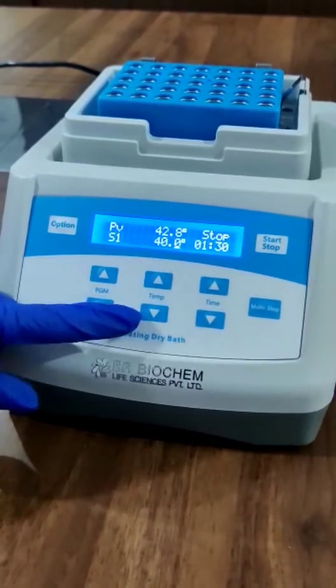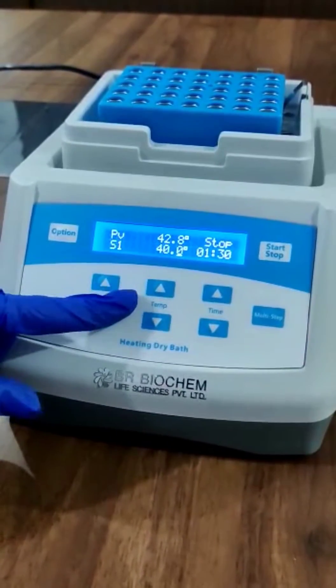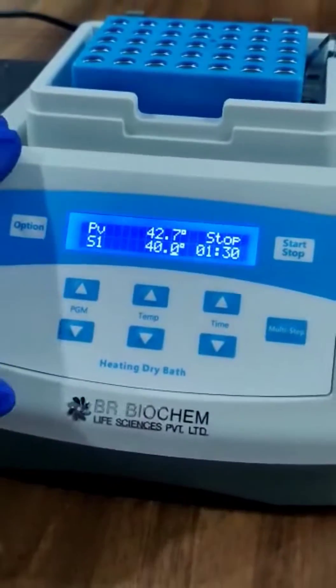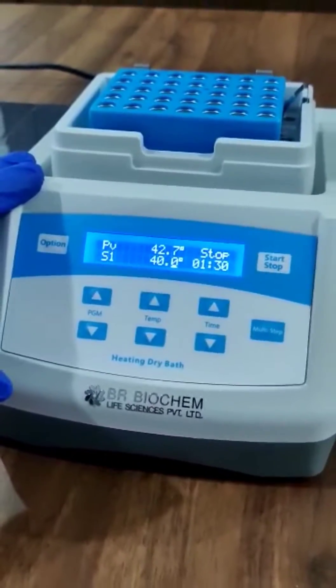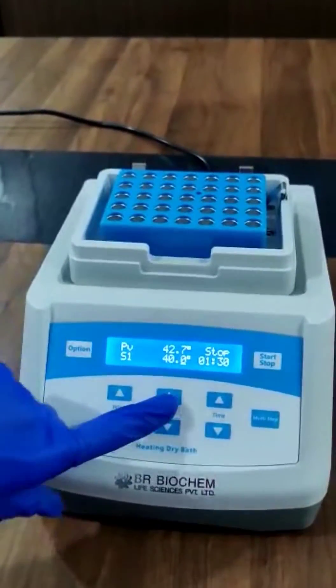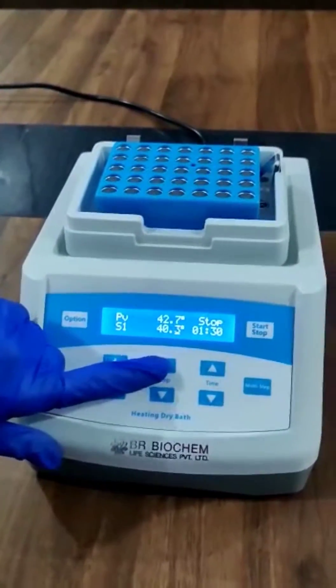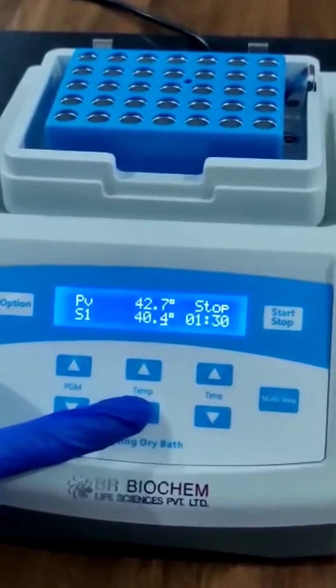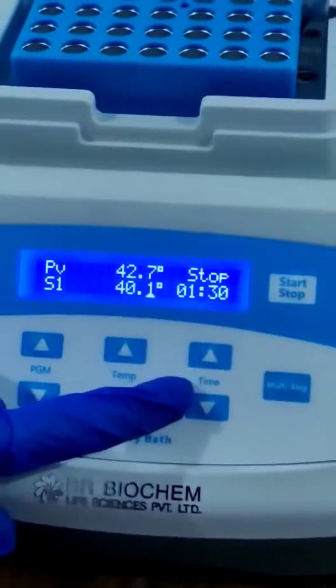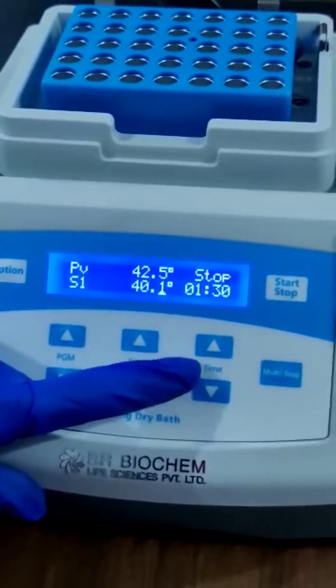From these two keys you can increase or decrease the temperature range of the dry bath incubator. This incubator has a temperature range of RT plus 5 degrees Celsius to 100 degrees Celsius. From here you can increase the temperature range, and from here you can decrease the temperature range.